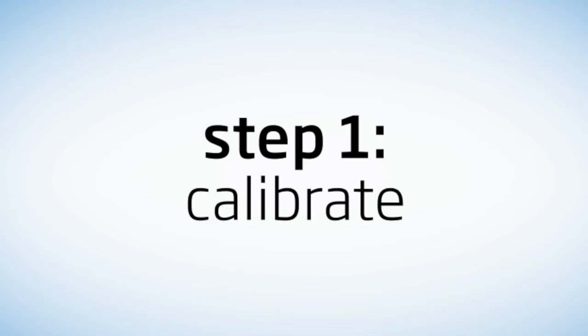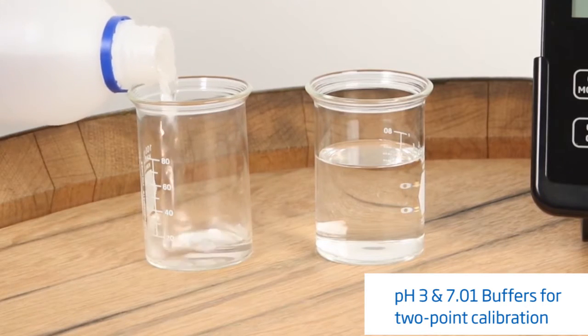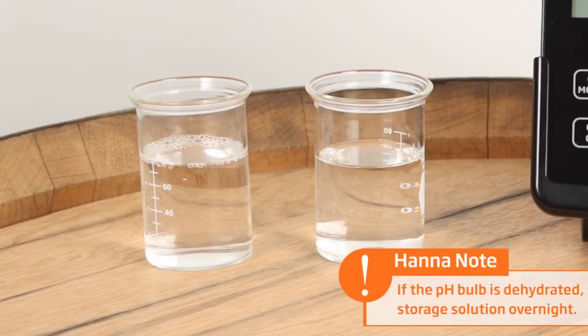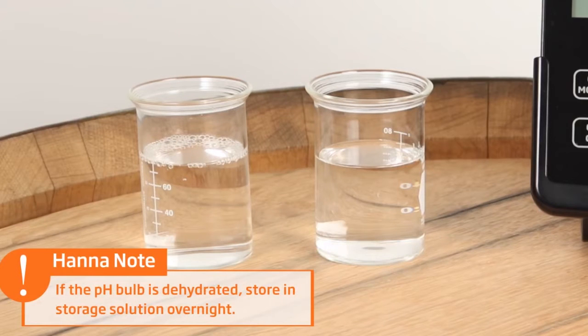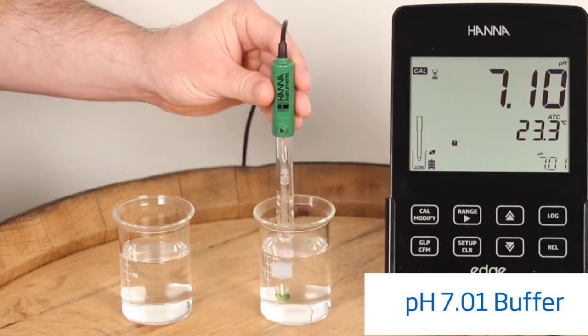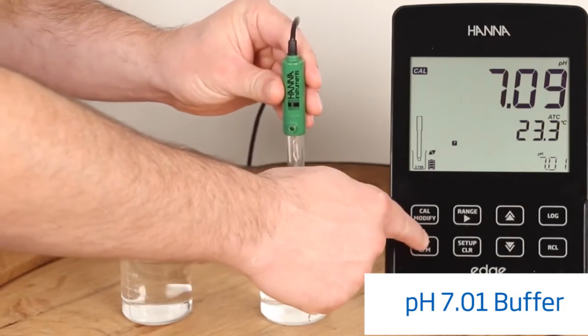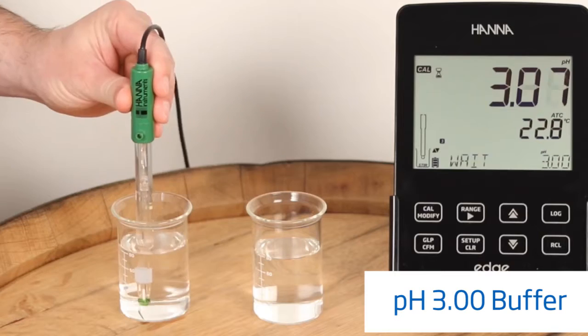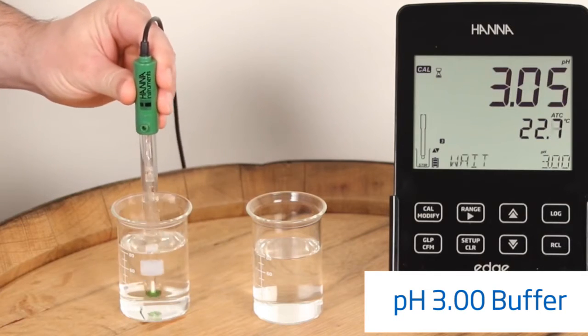Now that we've gone over the kit, let's open it up and start with calibration. Calibration is an important step in making sure your equipment is working properly to give you the best results. To calibrate your meter, first fill your beakers with pH 7.01 and pH 3 buffers. We recommend this two-point calibration for more accurate readings. Rinse and place your electrode in the pH 7.01 buffer and wait for a stable reading. Once the reading has stabilized, press confirm. Rinse the electrode again in fresh distilled water and place the electrode in your pH 3 calibration buffer. Once stable, press confirm and you have your two points calibrated.